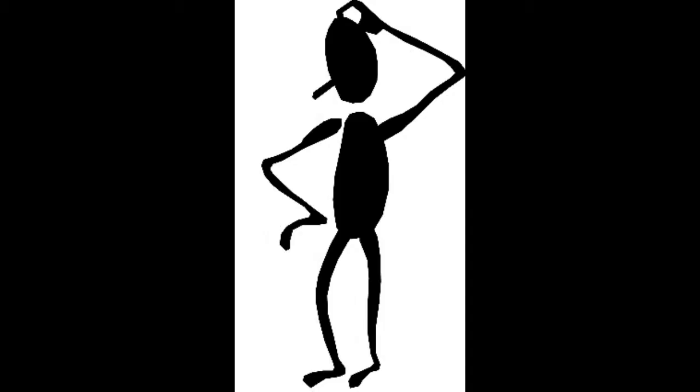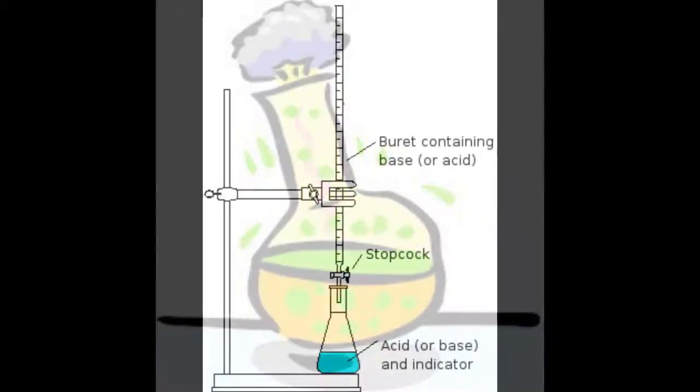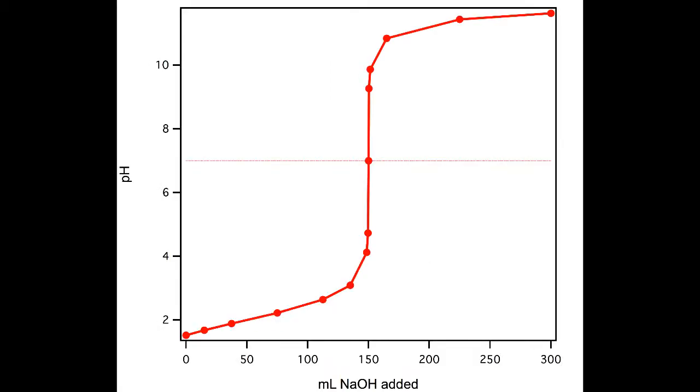A common question chemists have to answer is how much of something is present in a sample or a product. If the product contains an acid or base, this question is usually answered by a titration. Acid-base titrations can be used to measure the concentration of an acid or base in solution, to calculate the formula, molar mass of an unknown acid or base, and then to determine the equilibrium constant of a weak acid or weak base.